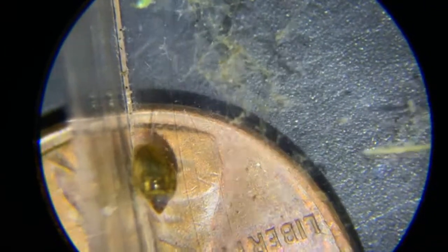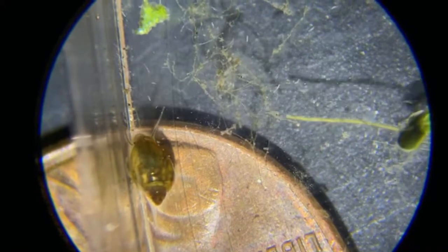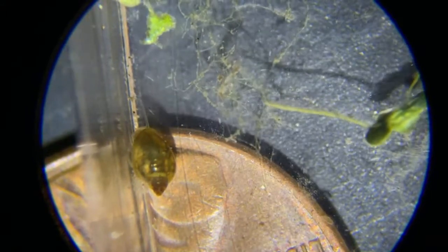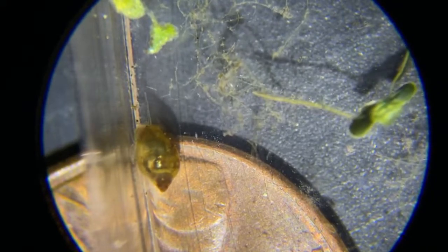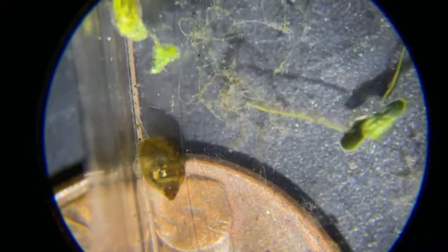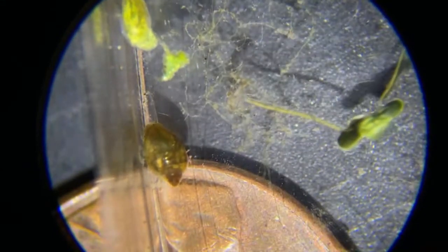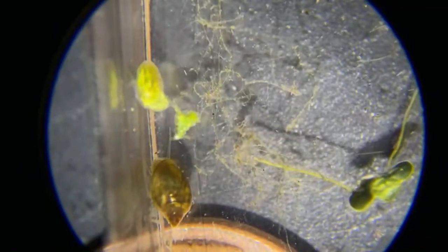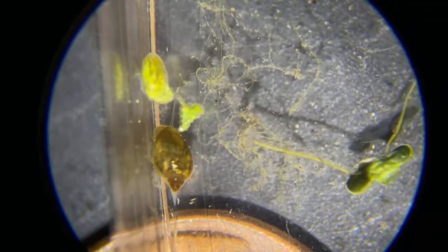And as we know from before, I did add some water to this slide. I did add some water to this snail right here. And sometimes I look at paramecium under the microscope. Well, what's fun, hello, Balaz, if that's how you say it. If you notice those little white things swimming around, those are paramecium. And they're truly, you can't see them with the naked eye. Your eye can't resolve them. At least the normal human can't. So I did add some paramecium to this to give it some scale. So in the grand scheme of things, this snail is huge. He's a giant.